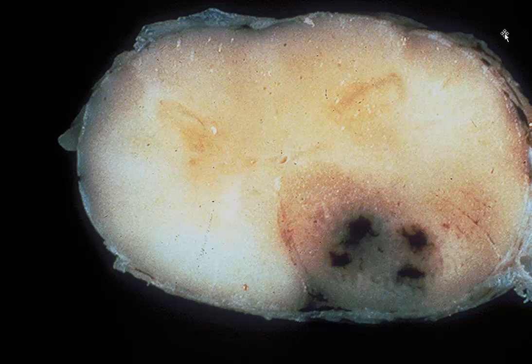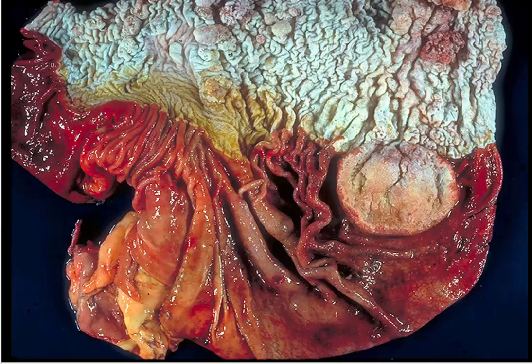Okay, ready to move on to the second one? Slide number 2 is also from a horse, and I would like a morphologic diagnosis for this.